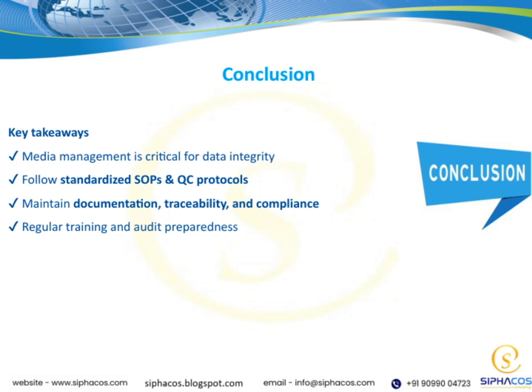Maintaining thorough documentation, traceability, and compliance is also vital. This not only supports transparency, but also allows us to track any issues back to their source if needed. Lastly, regular training and audit preparedness are crucial. They ensure everyone stays up to date with best practices and that we're always ready for inspections or reviews. Together, these points emphasize a comprehensive approach to managing data quality and integrity, which is the backbone of our overall success in this field.